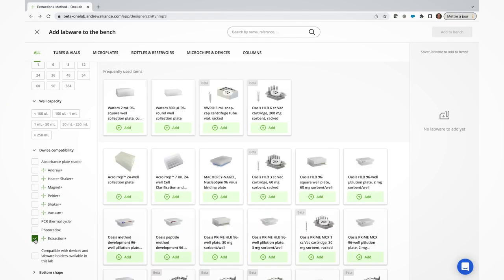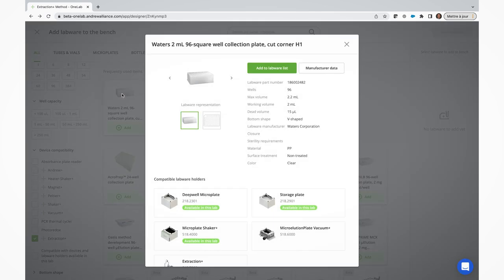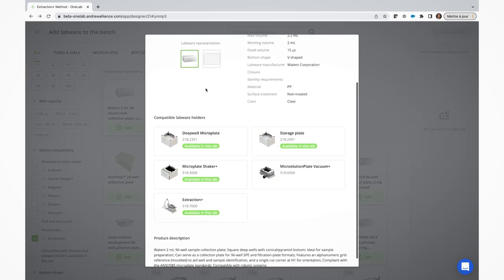So let me show you how to create a protocol step that will utilize the power of the Extraction Plus device. Let's start with a selection of compatible labware. Once in the protocol designer window of OneLab, filter out the consumable list to show our current options.